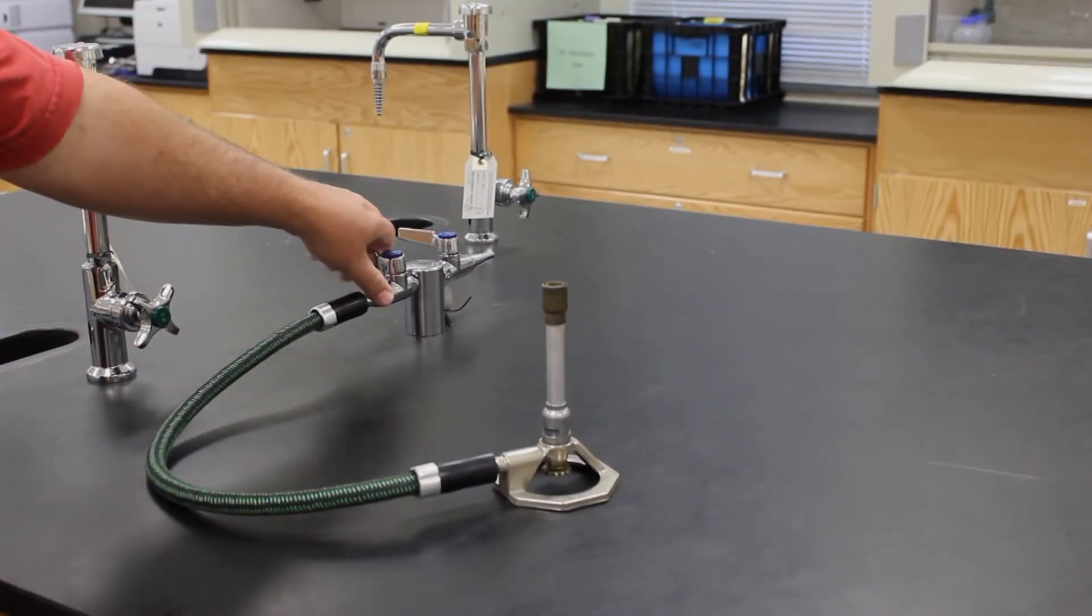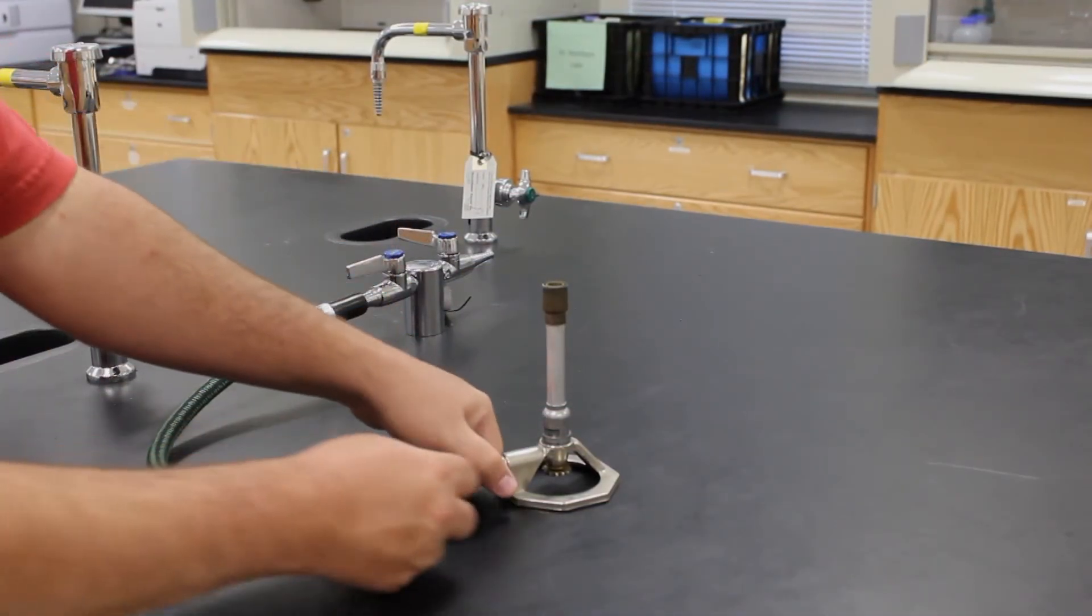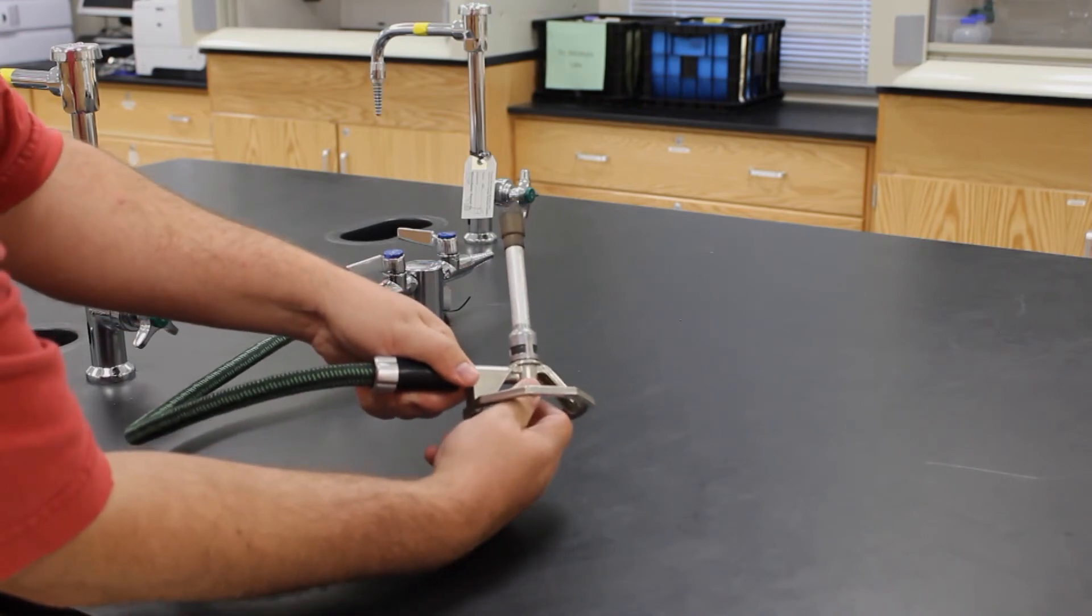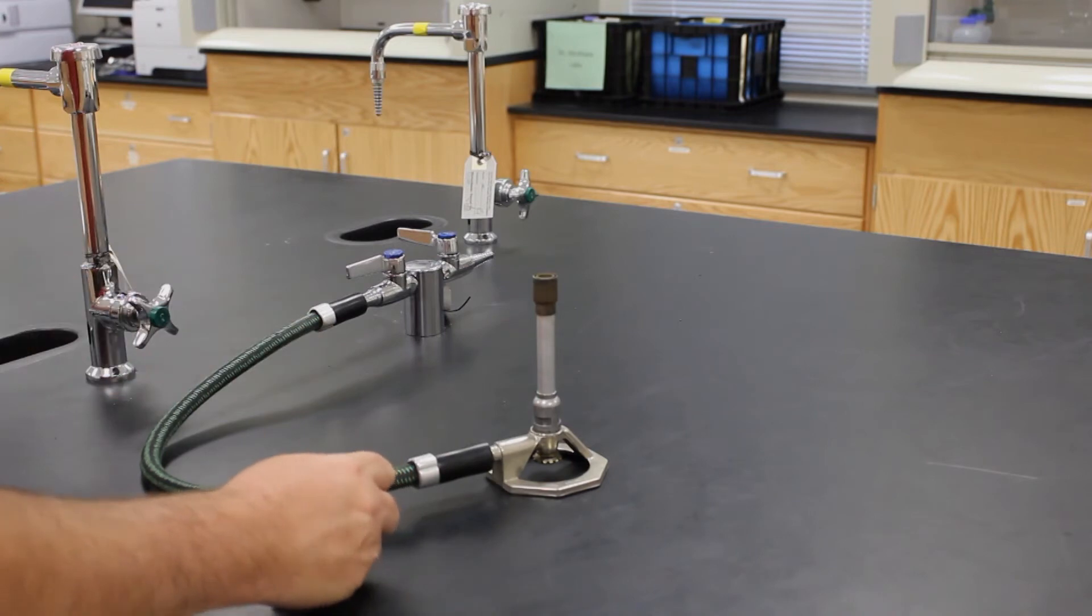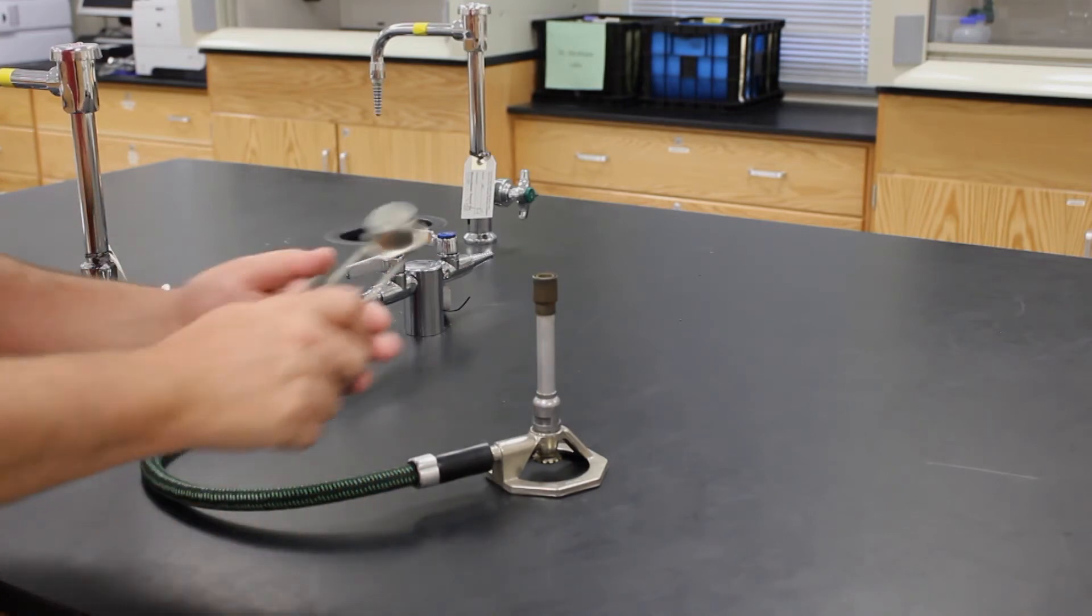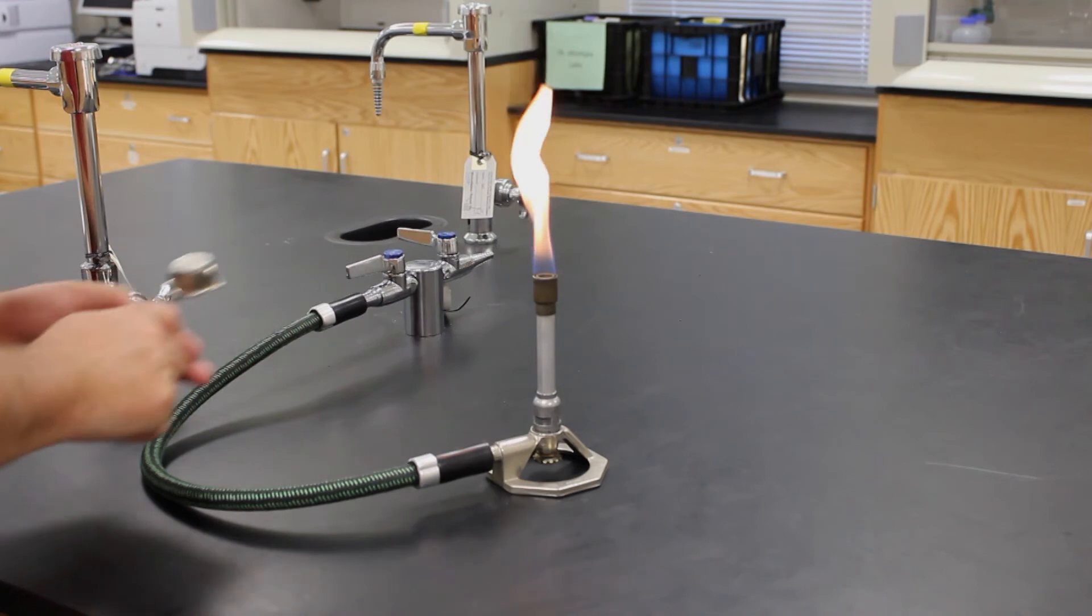First, you will check the hose and its connections and then turn on the valve on the desk. Open the needle valve on the burner approximately a quarter of a turn or until you hear the gas. Quickly use a striker to light the burner. Make sure to keep your hands back.